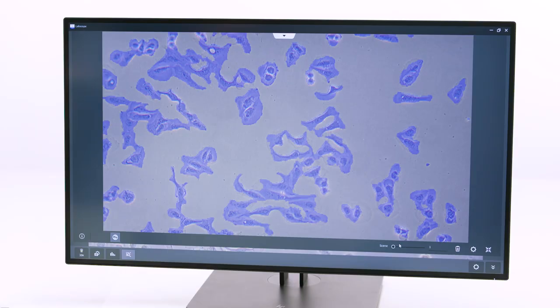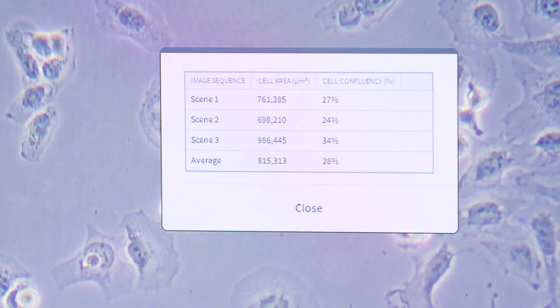Visually done, defining cell confluency can be a rather subjective and error-prone process with varying results.